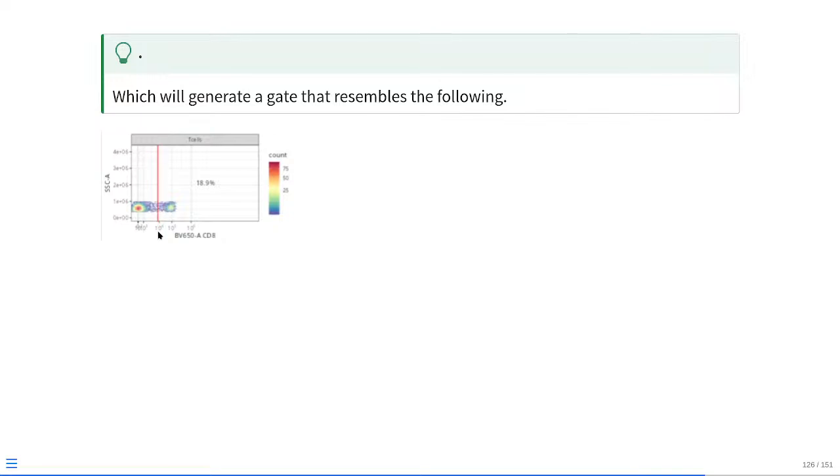So obviously, this approach using an algorithm will work best for primary style markers, things that have both positive and negative cells present within the same sample. Obviously, if you're working with some of those secondary or tertiary markers, where it's just a little sliver over here and it never separates into a separate population, this won't be the algorithmic method that you want to use.